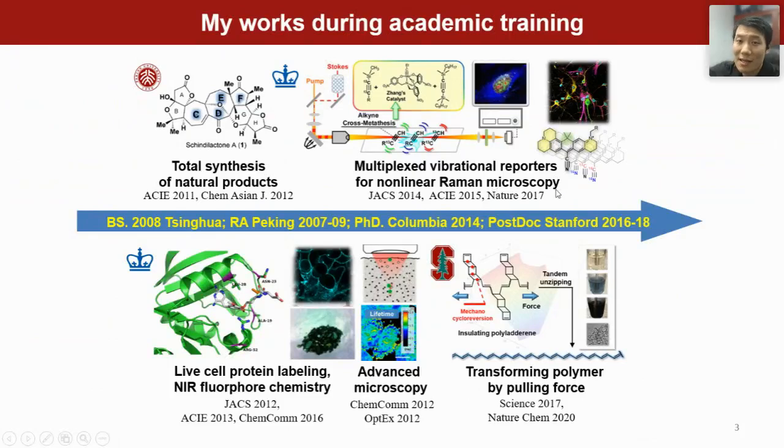This microscopy can offer a lot of colors, more than fluorescence. We can do 10-color imaging because the Raman band is much narrower than fluorescence. On the probe part, I developed a lot of probes specifically for Raman, such as isotope labeled alkynes and nitriles. They are very narrow and they offer multiplexity. We can do up to 10-color imaging. So during my track record, I have always been not only developing new chemistry, but working together with microscopists so that we can really have cutting edge probes.